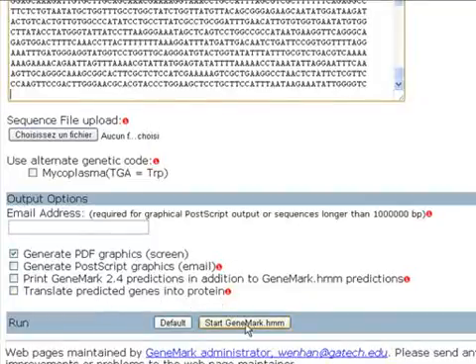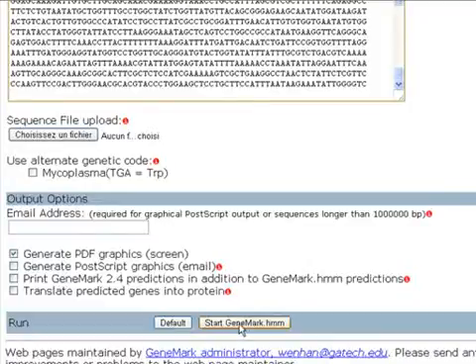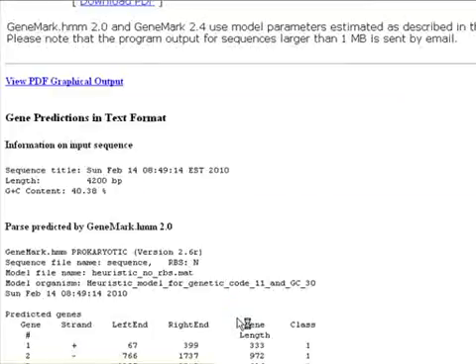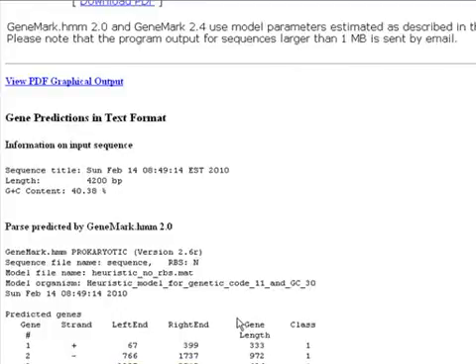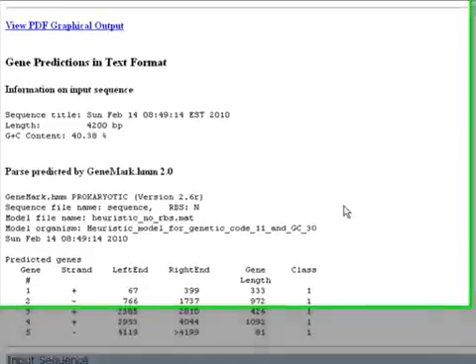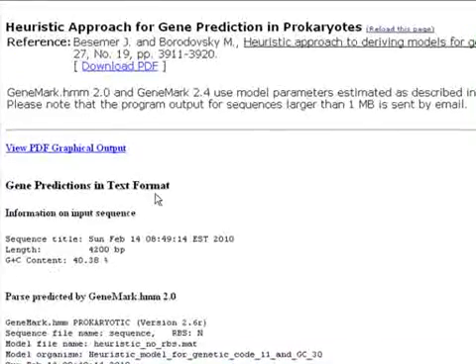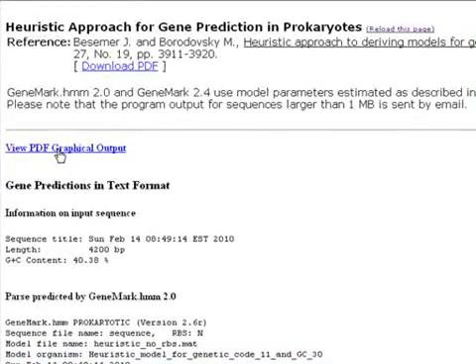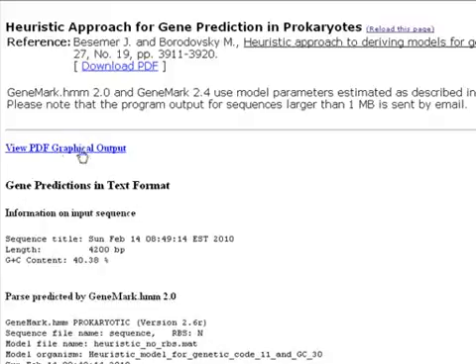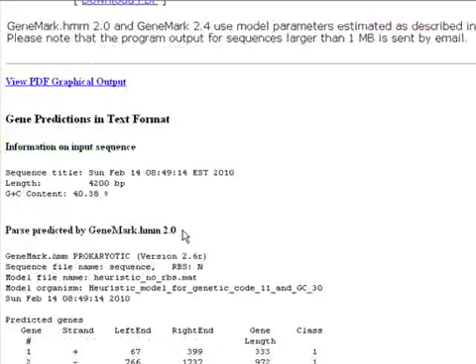To start the program click on Start GeneMark.hmm and wait for the result page to appear. This is a very fast software so we can click here to download our PDF graphical output which I've said is very useful. And here is our text format.